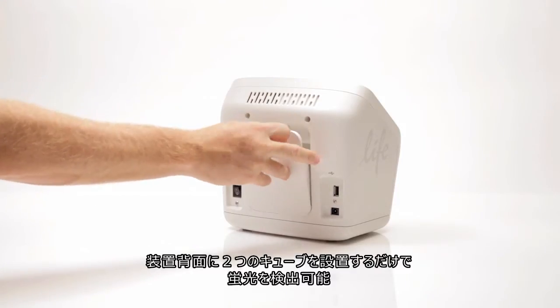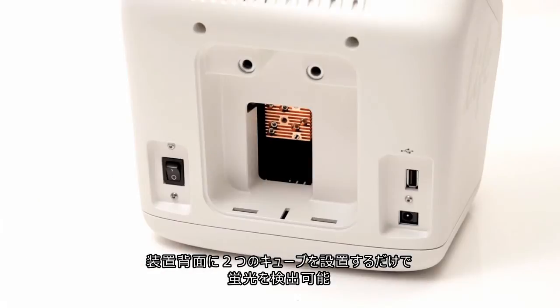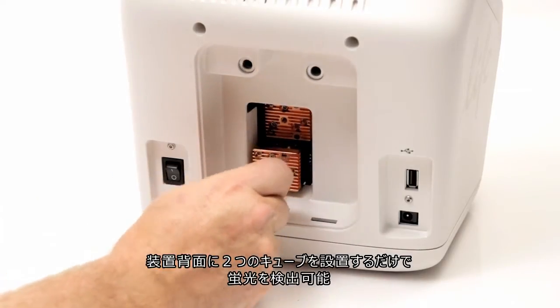Simply open up the back of the instrument, add up to two light cubes, and the Countess2 FL is ready to count fluorescent samples.